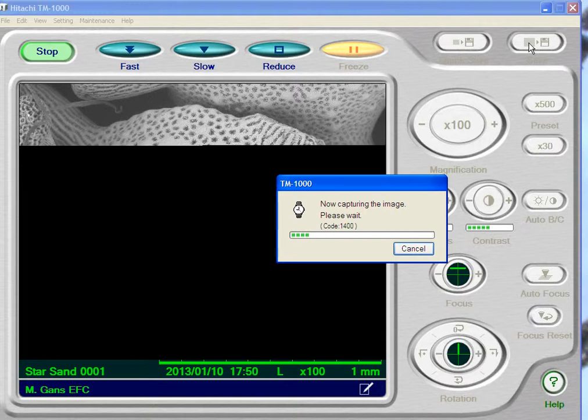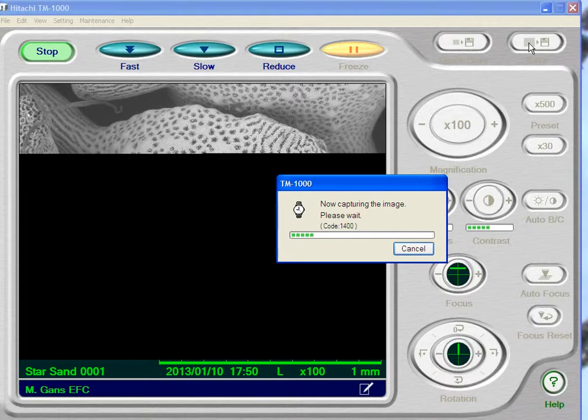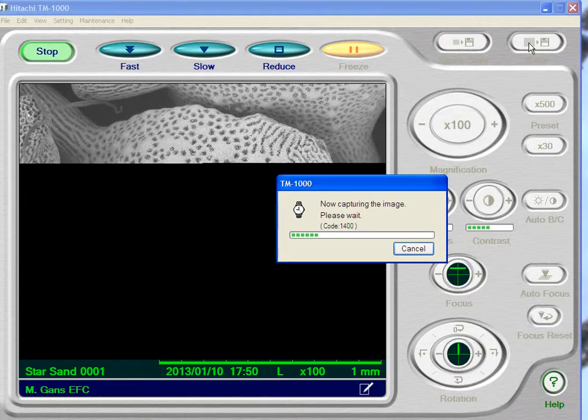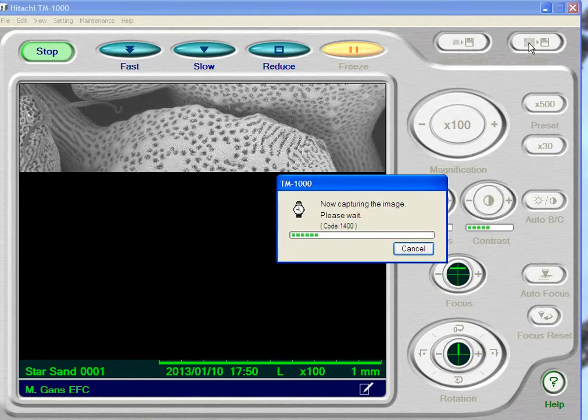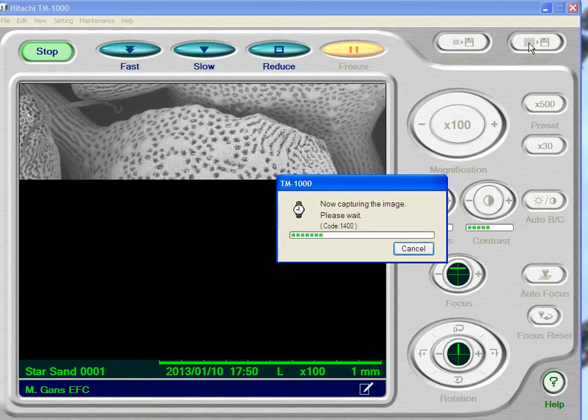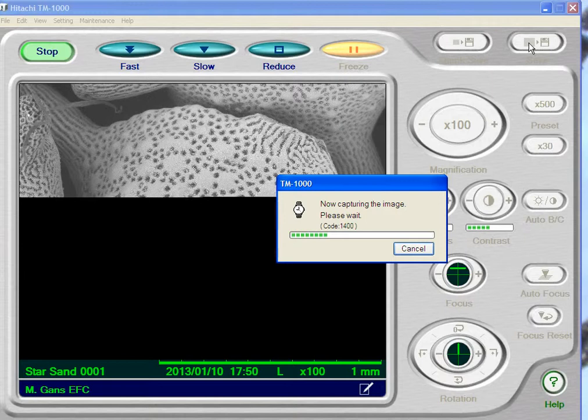It's going to capture our image line by line. If you'll notice, it's scanning even slower than our normal slow scan rate because you want the most information you can get out of the image.